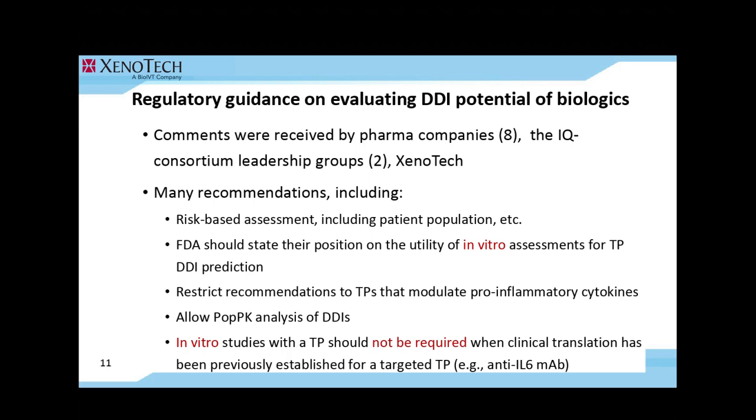Our assay, in its current format, is suitable for some, but not all, immunomodulators. Our emphasis is on compounds affecting cytokines, more specifically drugs that stimulate the release of cytokines in whole blood. It is anticipated, although not specifically demonstrated, that the effects of cytokines released from Kupffer cells are also accounted for in our experimental design. The following sequence of events illustrates immunomodulators perpetrating drug interactions.